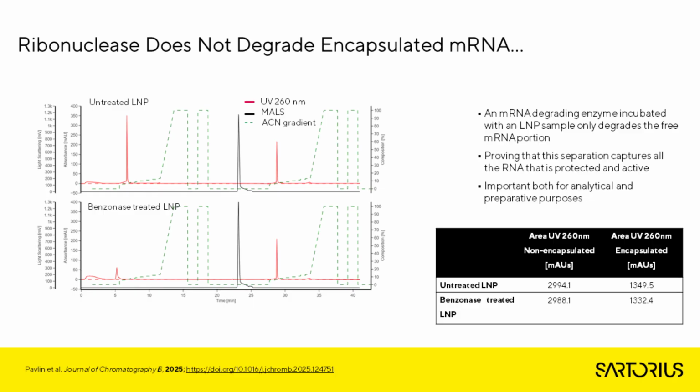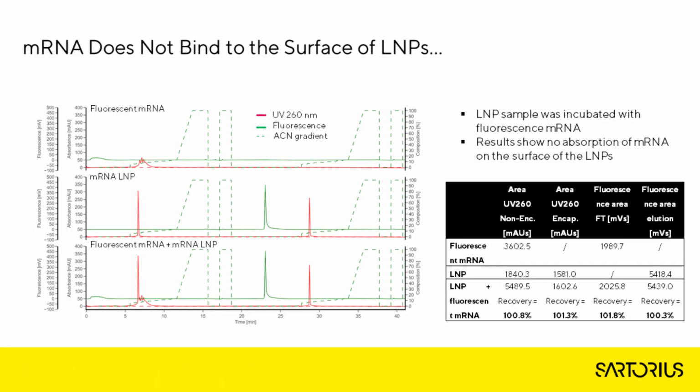So the amount of determined encapsulated mRNA was the same in both cases. We were also asking ourselves if there is some mRNA binding on the surface of lipid nanoparticles, and this mRNA was shown as encapsulated mRNA.